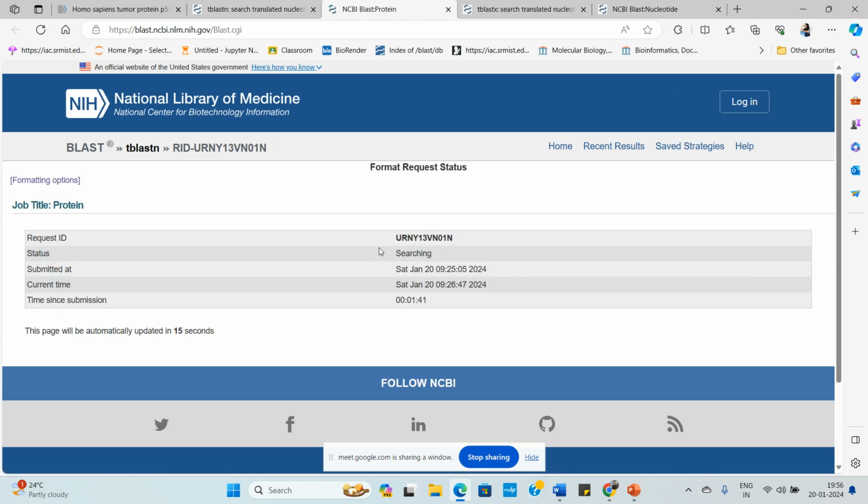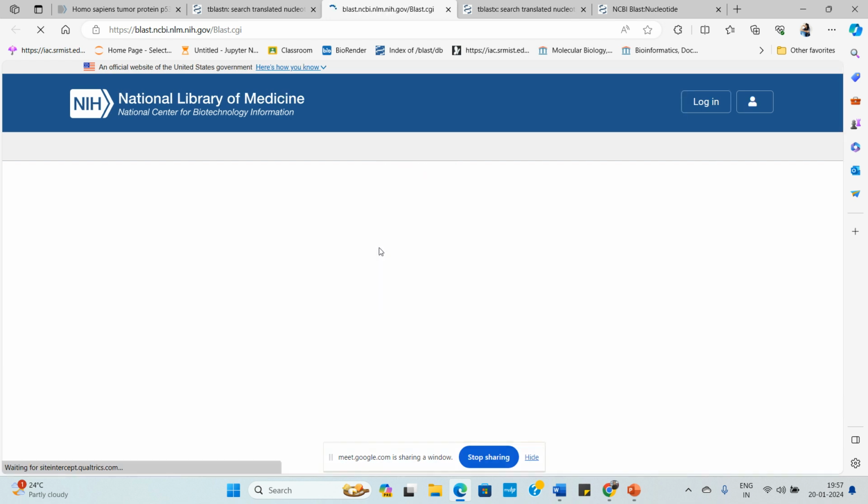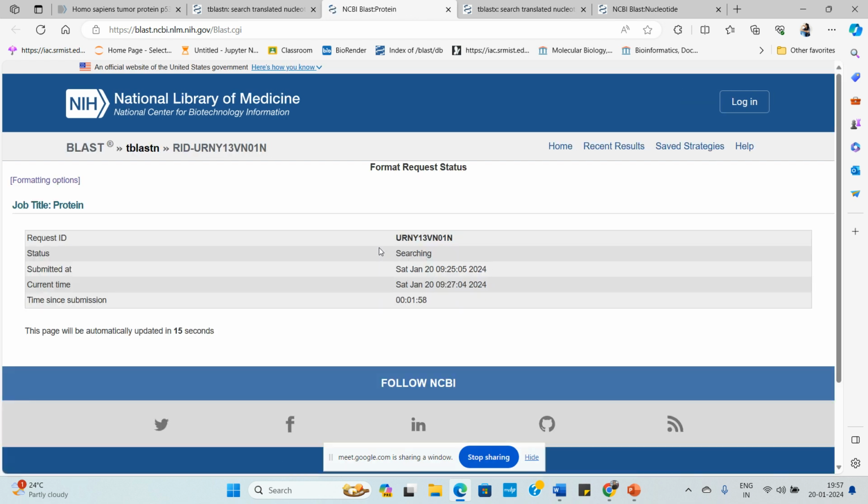So what I'm telling here is, you have to focus on the minute details in the BLAST output, because you can't design primers in the 3 prime to 5 prime direction. You can't make it as a forward. So you have to know all these things. It depends on what research outcome you are expecting, why you are using BLAST, and for what purpose you are using BLAST. So for that, you have to understand the basics.